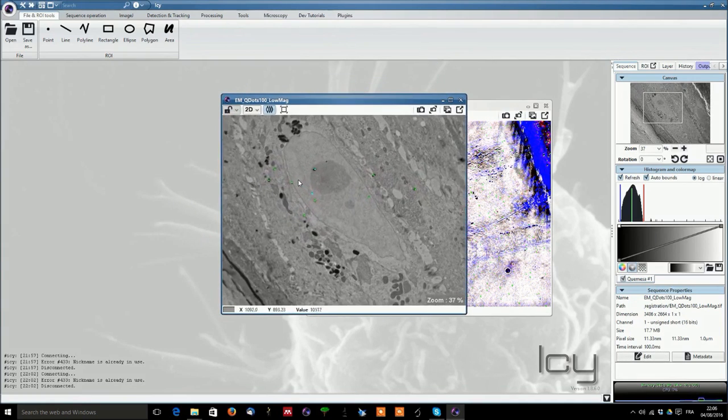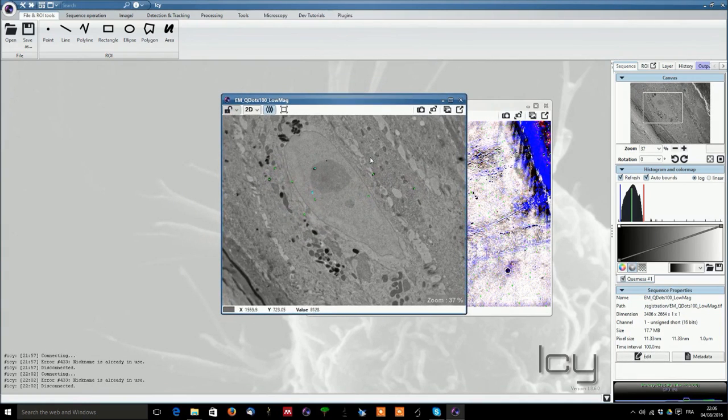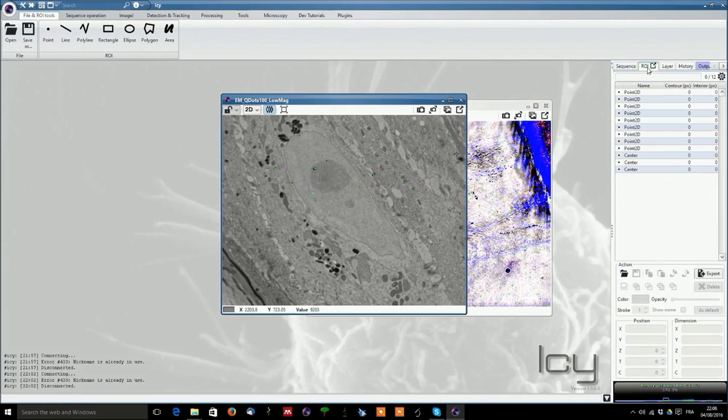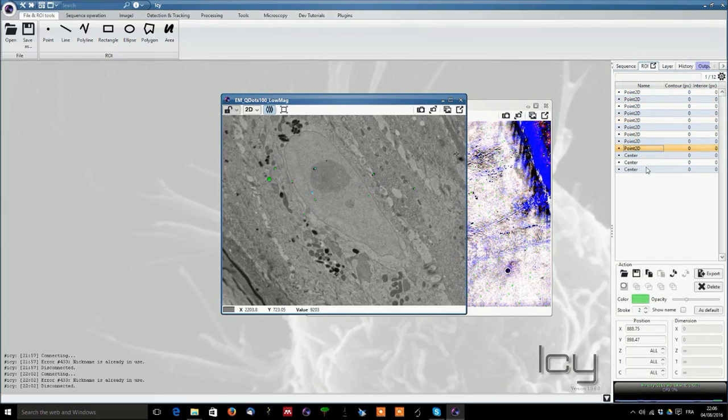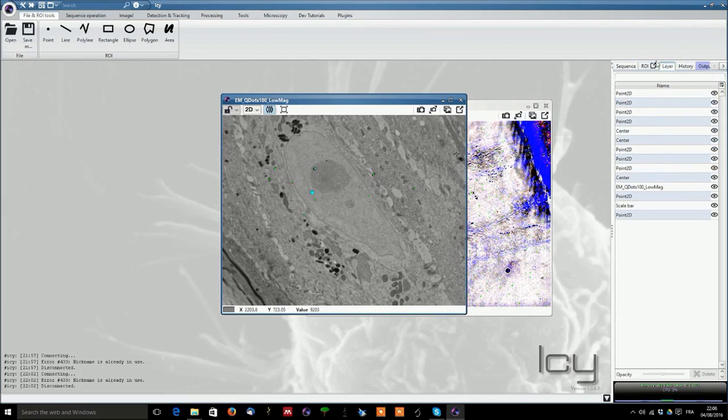Now from there, if you are looking at this picture, as we said earlier on, we have some ROI points. These regions of interest here are stored in the region of interest window which are containing different 2D points. You can just highlight them by just selecting them separately according to what you need.